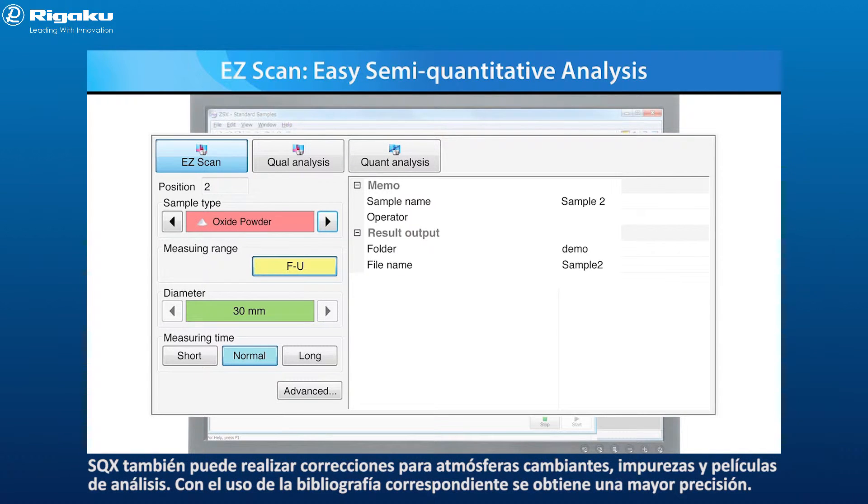SQX can also correct for varying atmospheres, impurities, and analysis film. Increased accuracy is achieved using a matching library.